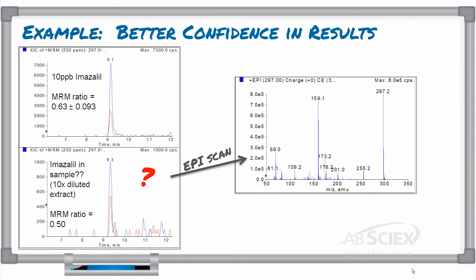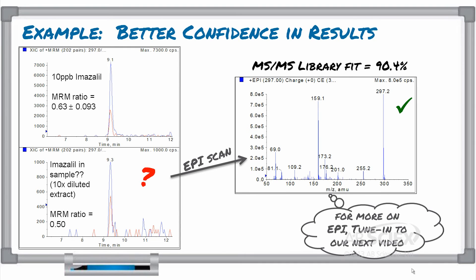You are also able to analyze the full MS-MS spectrum against a compound library database. You can think of this as running that fingerprint through a database to compare key characteristics to find a match. In this case, the spectrum of your unknown sample matched the library spectrum of imazalil with a fit of 90.4%. So, although the MRM ratio was slightly off and made the result a little ambiguous, the EPI scan data could be used to decomplicate the results and can give you more confidence in reporting this as a positive result.